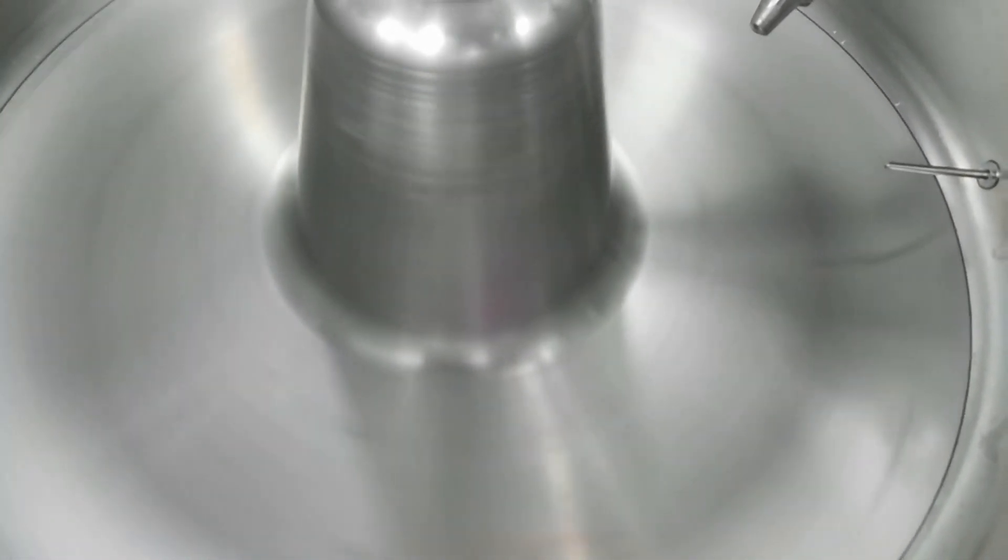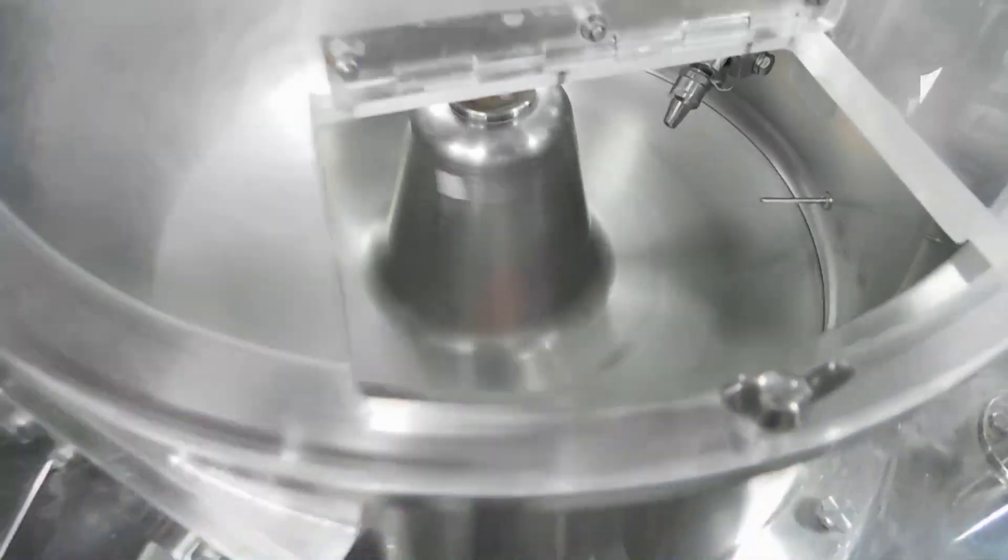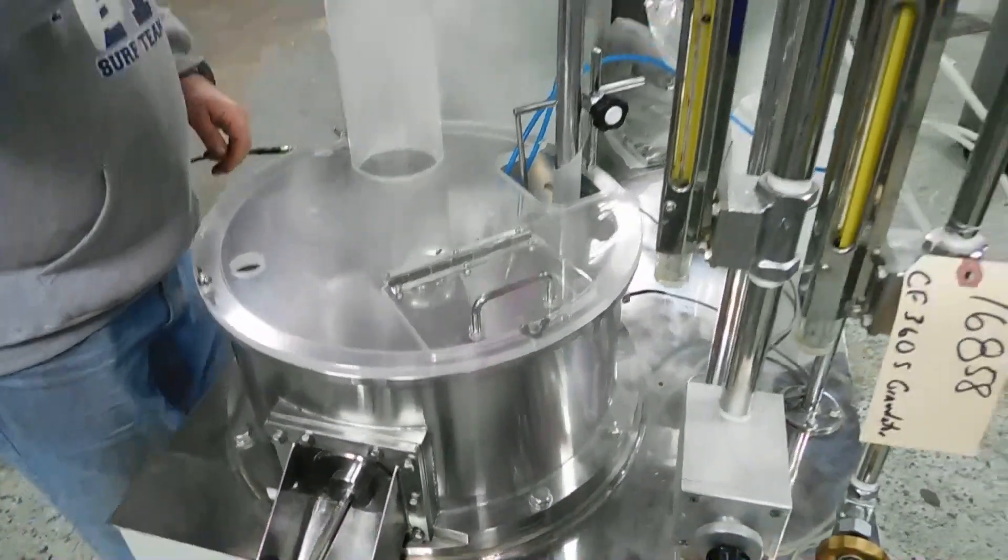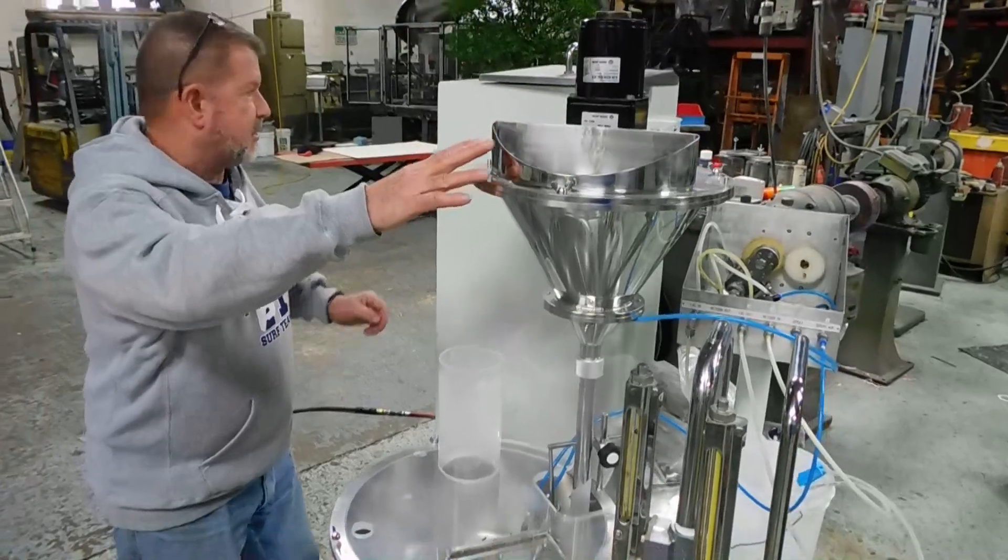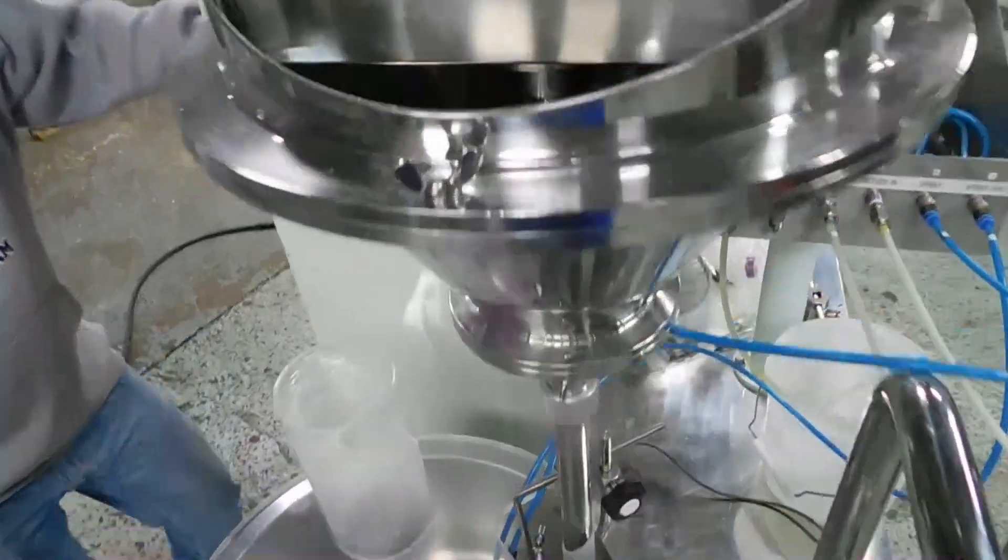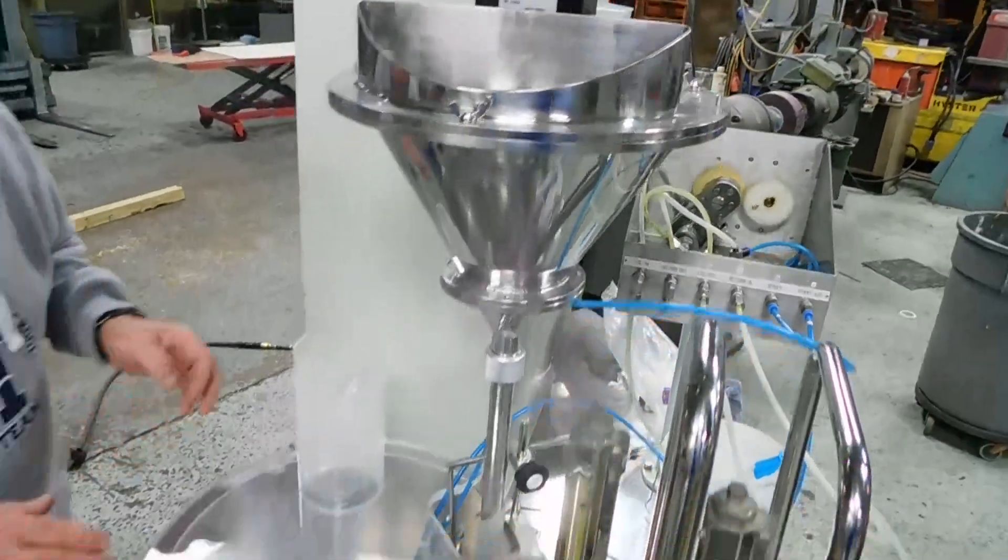We're running the heating system to it right now. And also, while our cameraman is there, this is the powder feeder. Take a look inside. That's also variable speed. You can slow it down or speed it up, depending on how much powder feed you want inside the bowl as well.